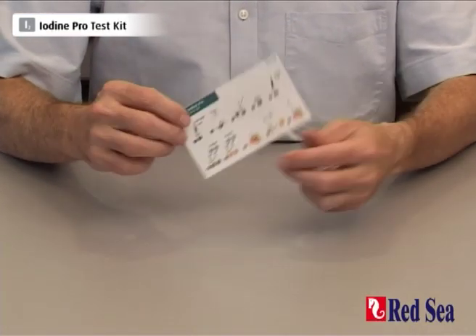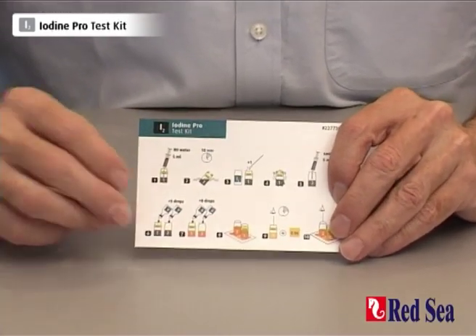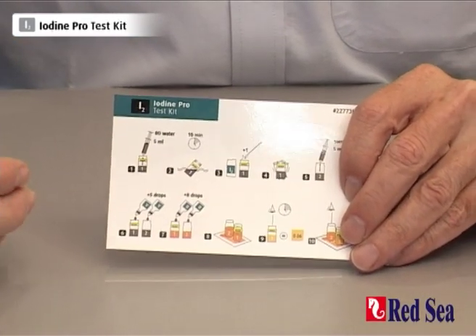We also provide a set of graphic instructions that make it easy to follow while you're actually performing the test.